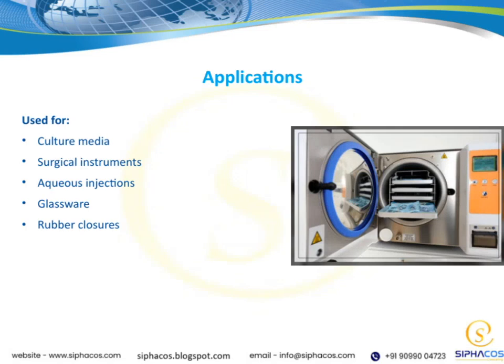Now, let's take a look at some of the key applications of this material. It's quite versatile and plays a crucial role in various fields. For example, it's used in the preparation of culture media, which is essential for growing and studying microorganisms in laboratories. This highlights its importance in microbiology and medical research.